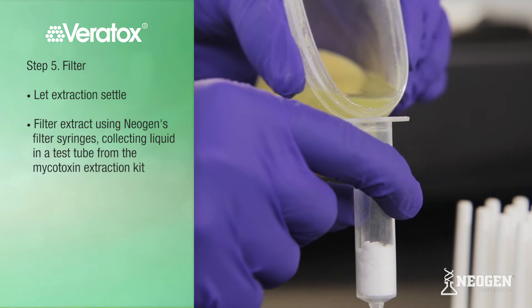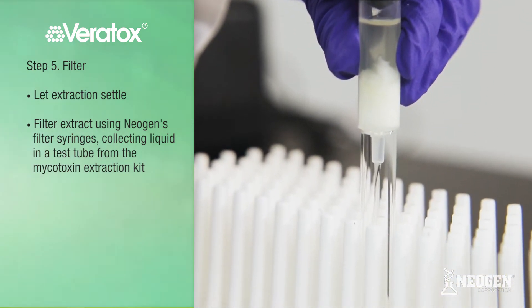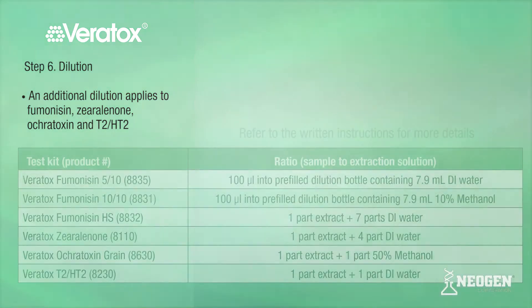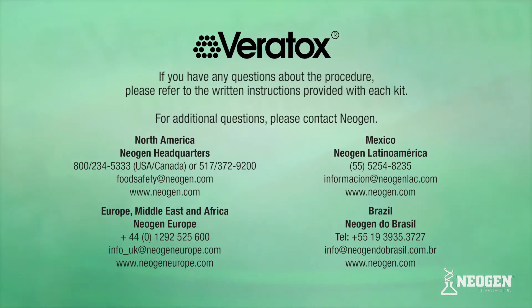Filter the extract using Neogen's filter syringes or Whatman No. 1 filter paper, collecting liquid in a test tube or cup. An additional dilution applies to Fumonacin, Zearalenone, Ocratoxin, and T2-HT2. The Fumonacin 510 and 1010 kits are provided with pre-filled dilution bottles, while the other kits can be diluted into a clean sample dilution tube. Refer to kit instructions for specific details. If you have any questions about the procedure, please refer to the written instructions provided with each kit or contact your Neogen representative.